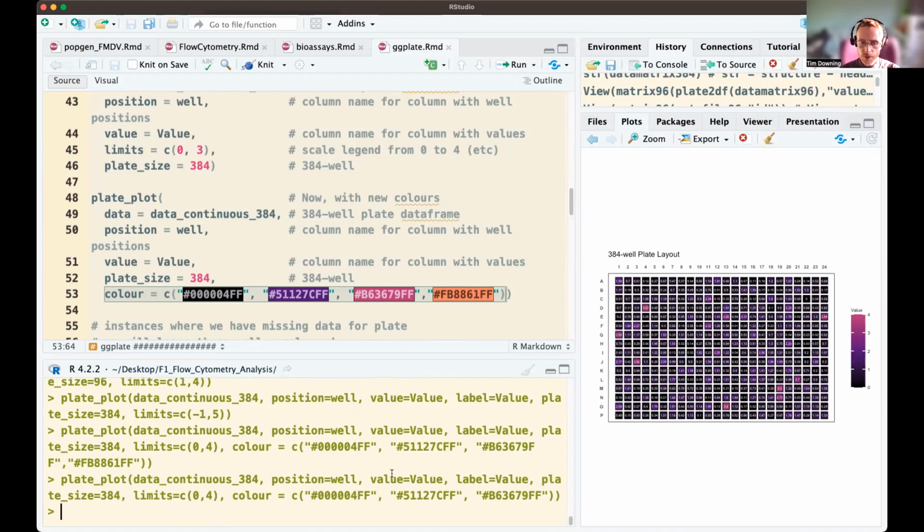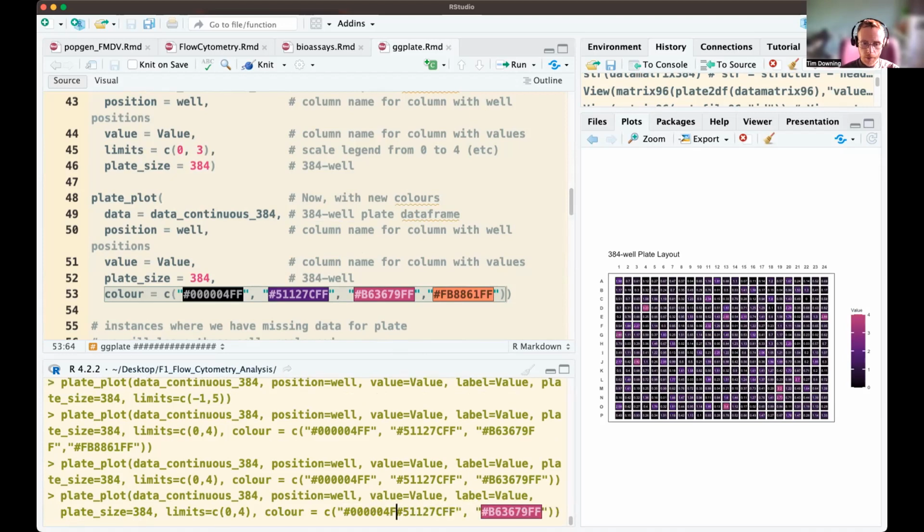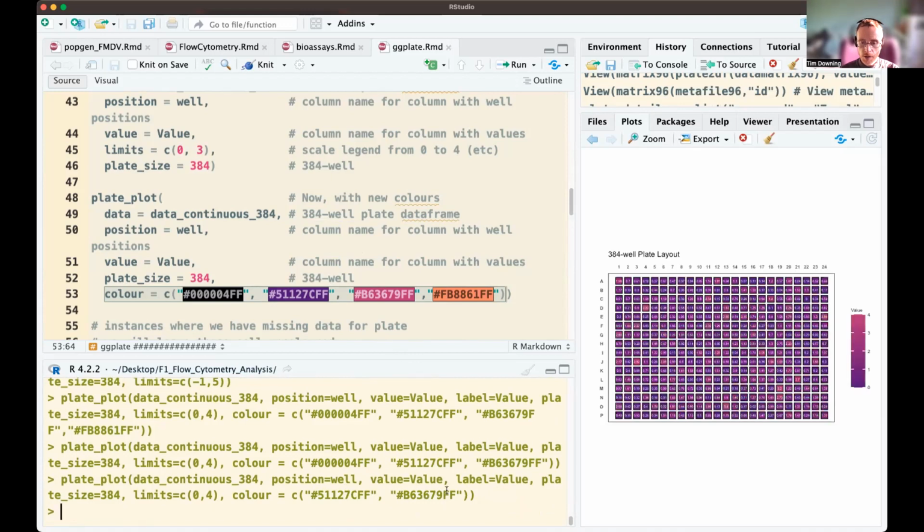So it just defines the range we're going to. You could go all the way from simply, say, purple to pink here like that, and we just range across a single gradient. So you can see that there.